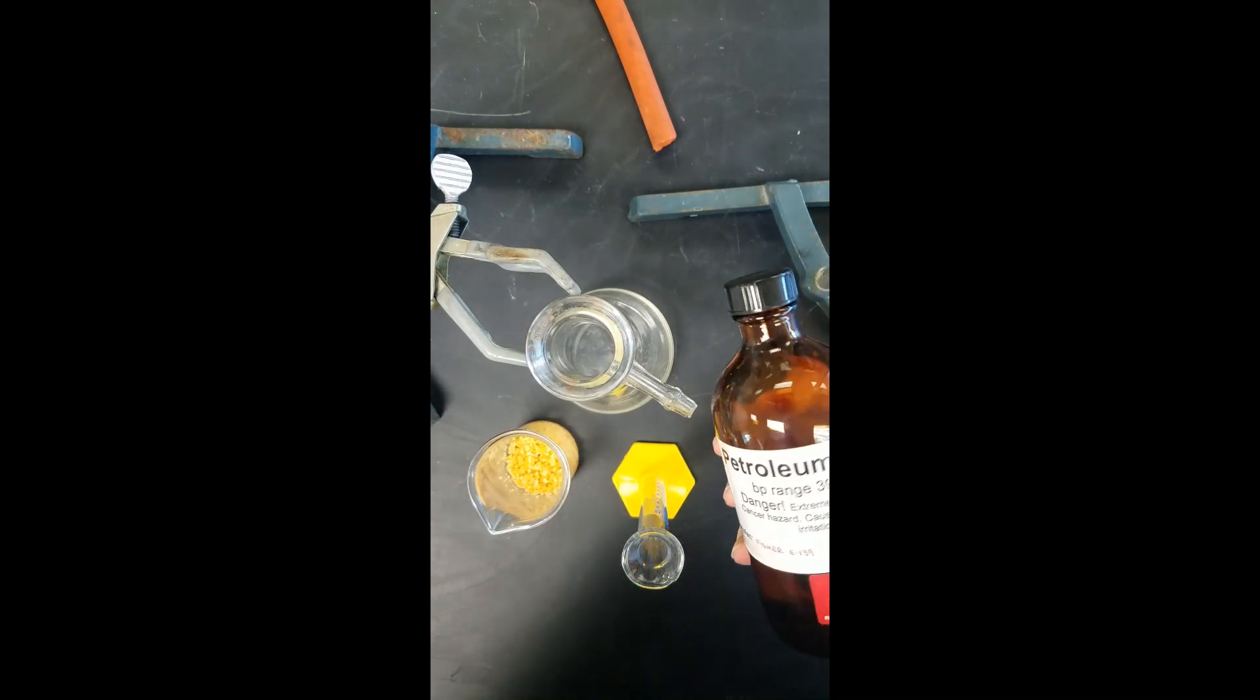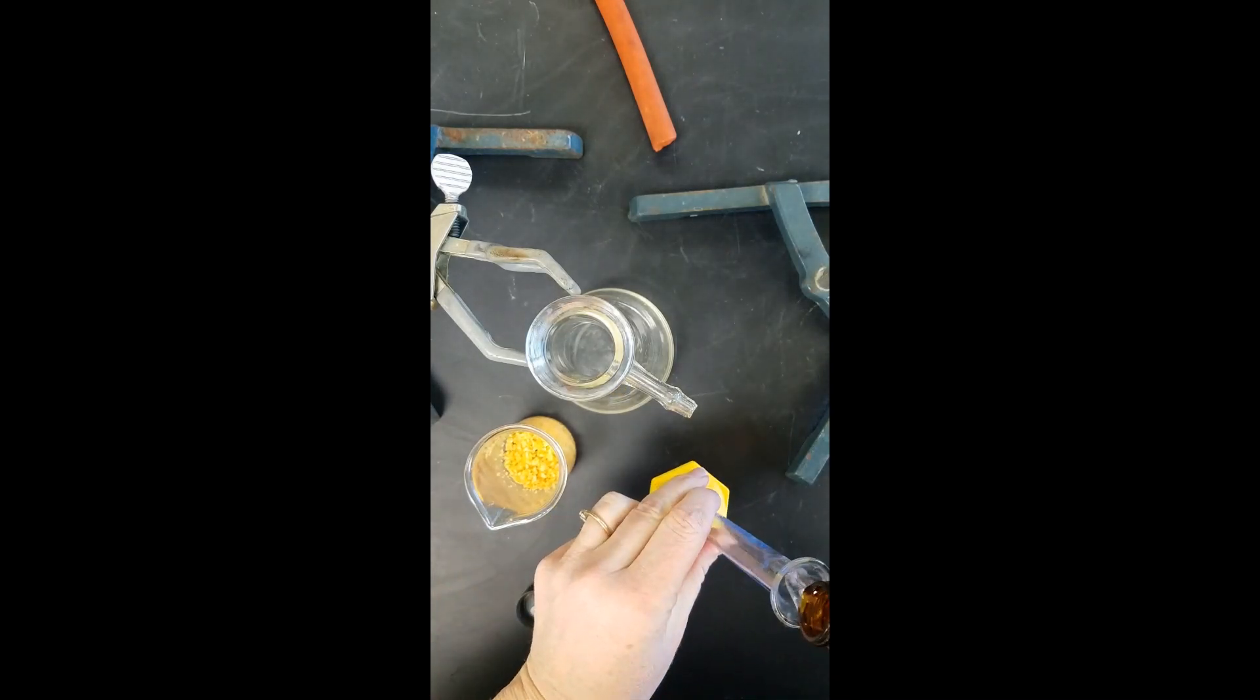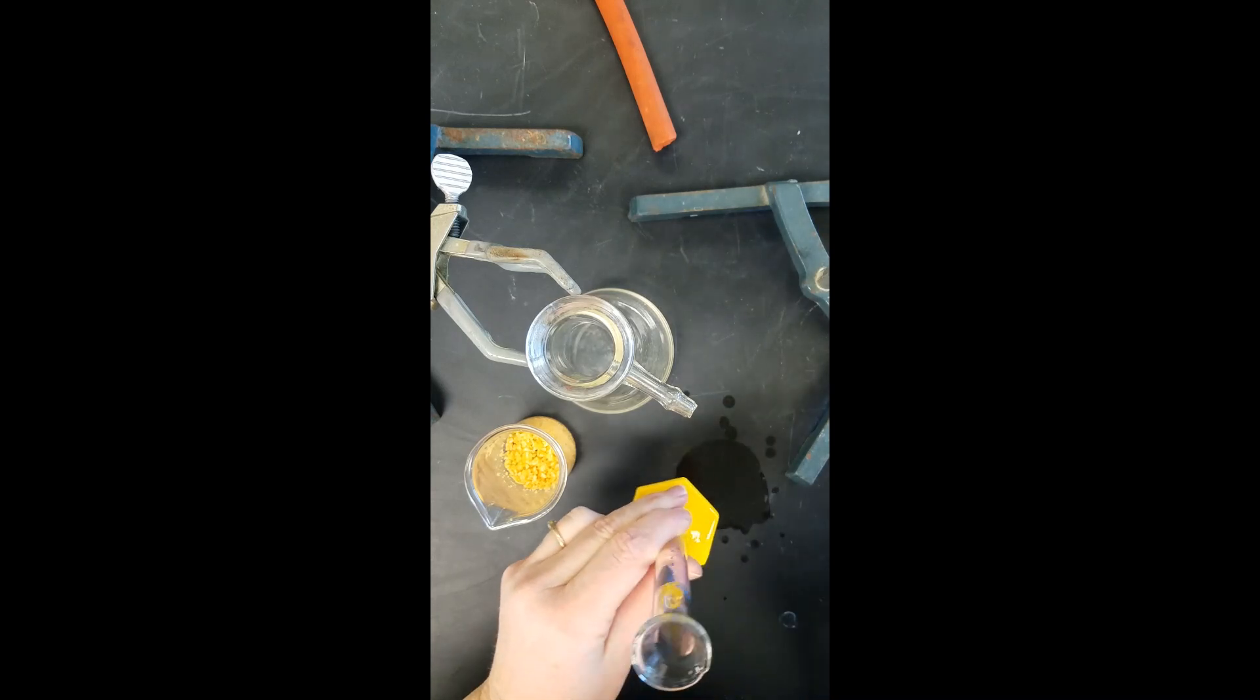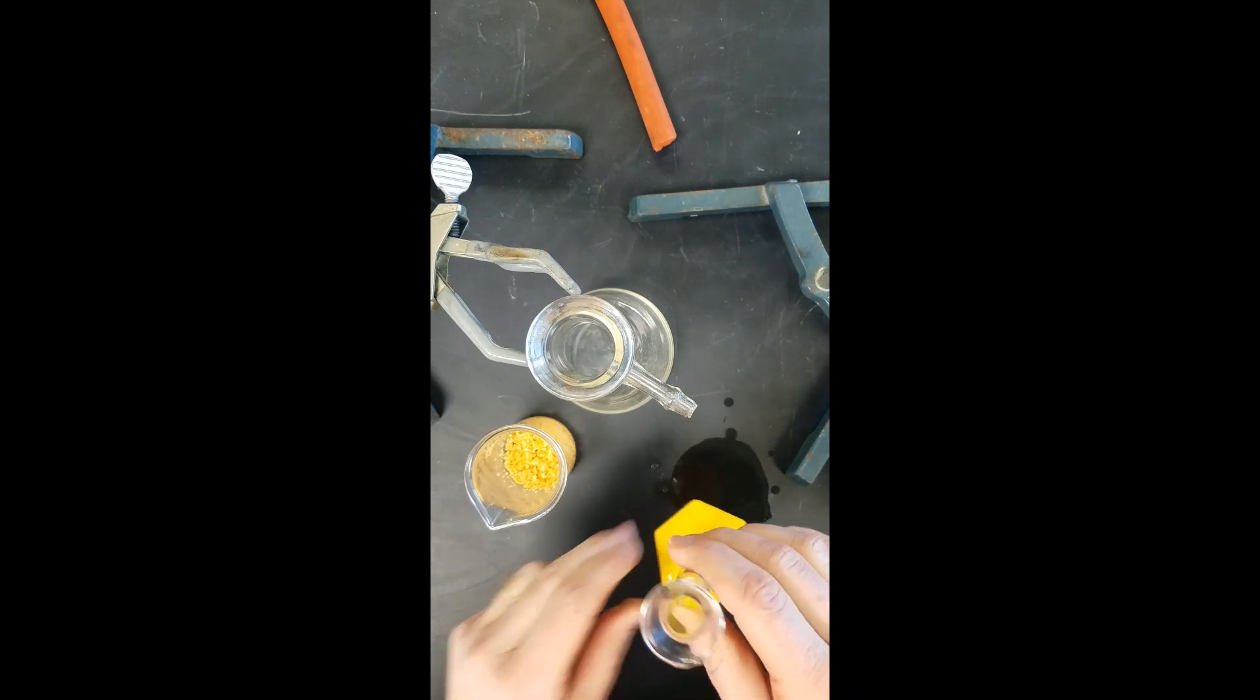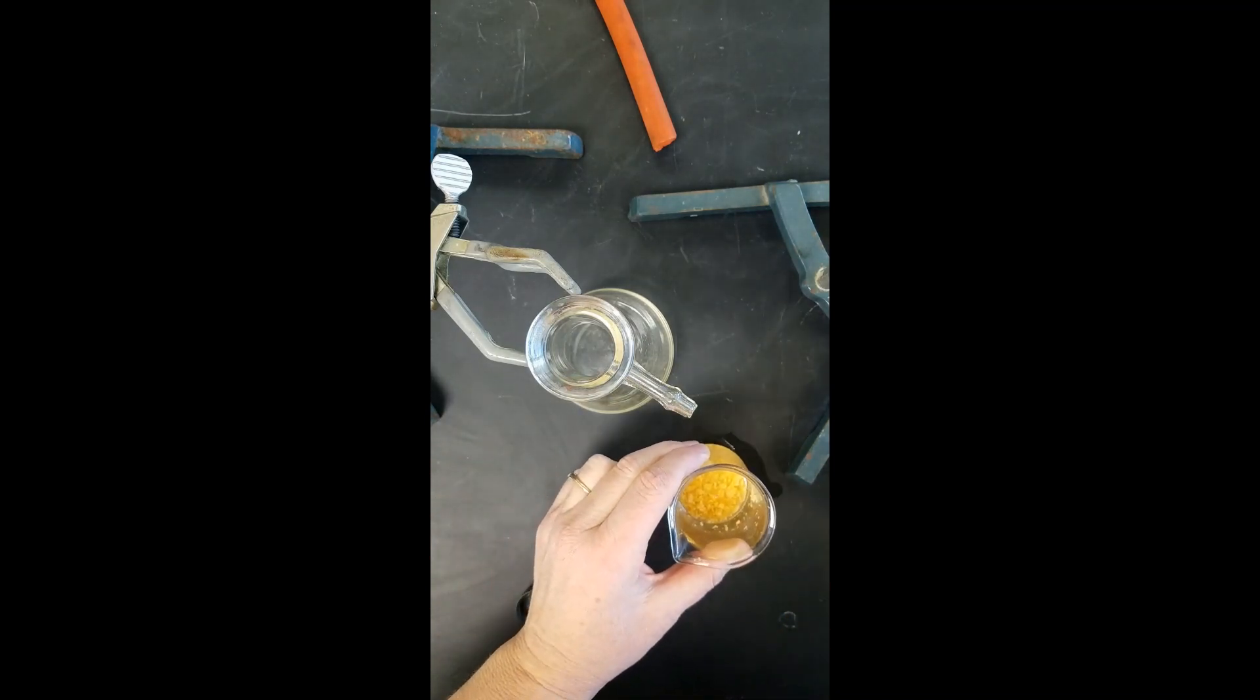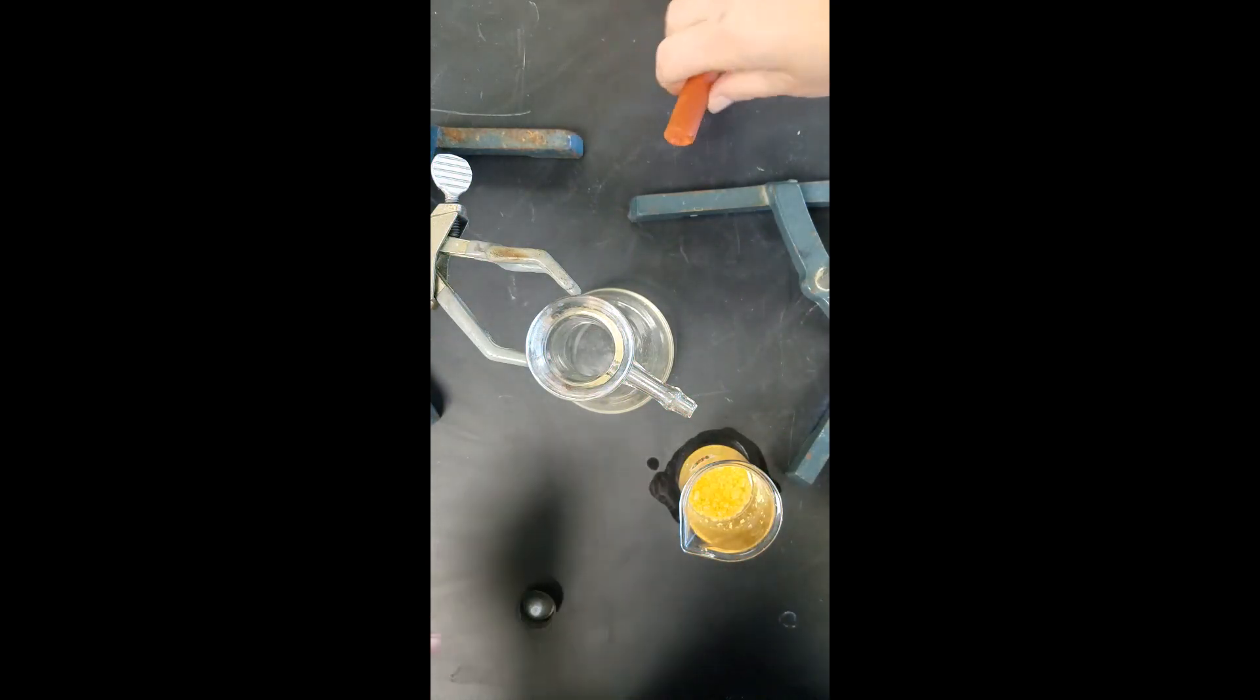We are now going to add 10 milliliters of petroleum ether. Again this volume doesn't have to be exact. I'm going to measure out about 10 milliliters and add it to the chips. We're going to mix this up for about one minute and we're also going to set up our apparatus.